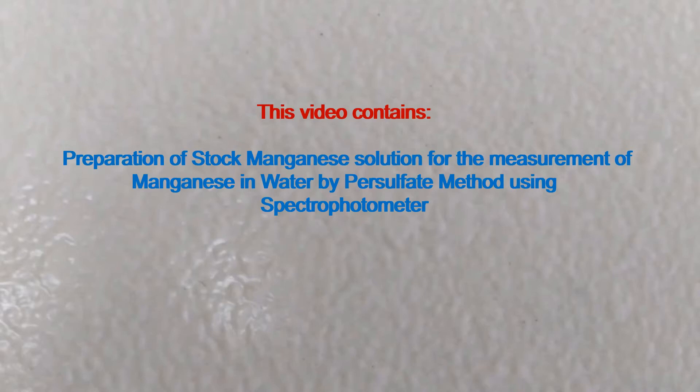This video contains preparation of stock manganese solution for the measurement of manganese in water by persulfate method using a spectrophotometer.